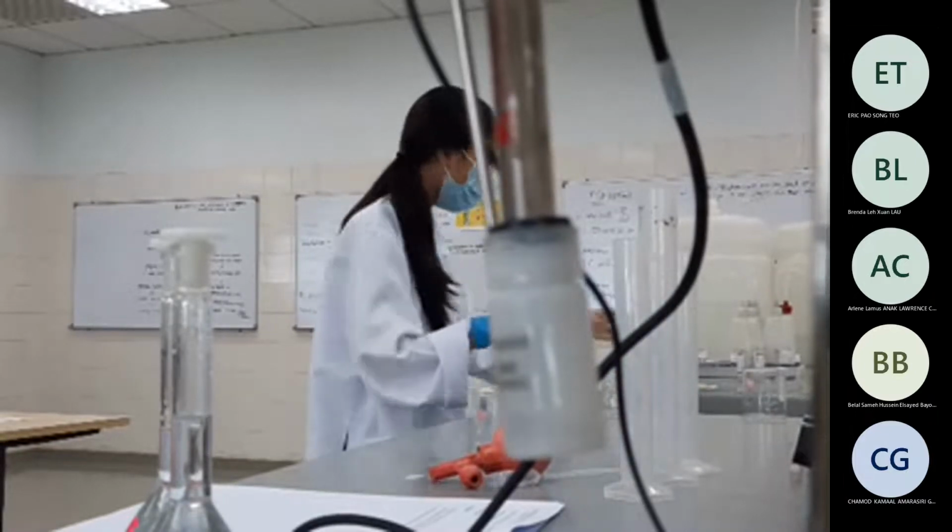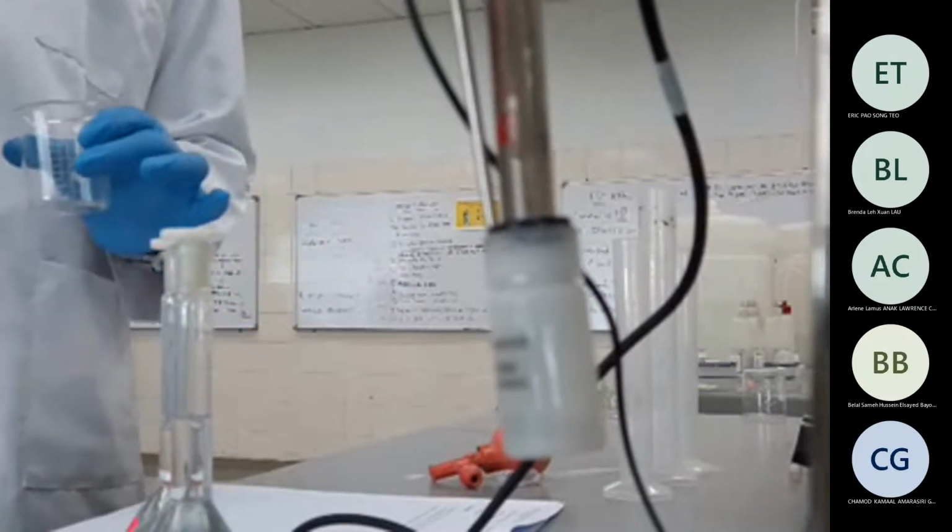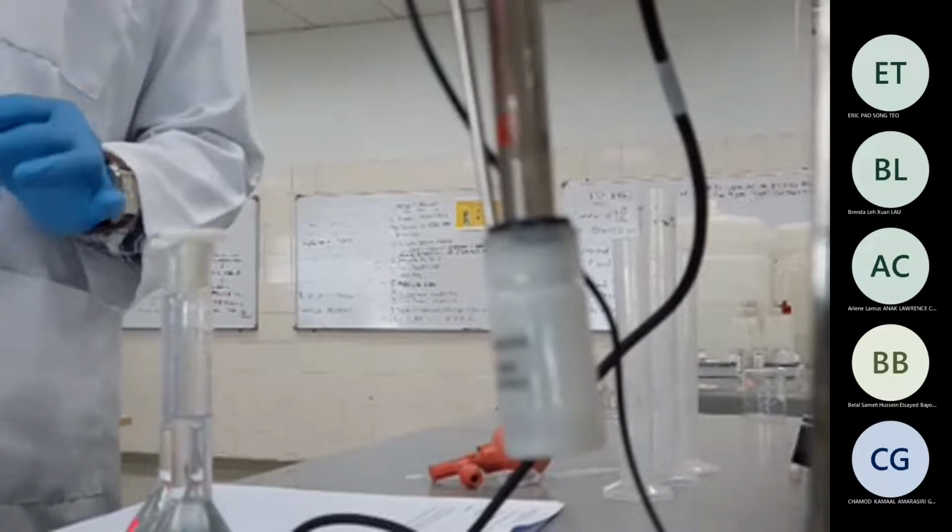In the beaker I'm washing now, I will take the solution and determine the pH of this. So if there is water, it will dilute more and you are not getting the correct reading. That's why I'm saying try to discard the water as much as possible.